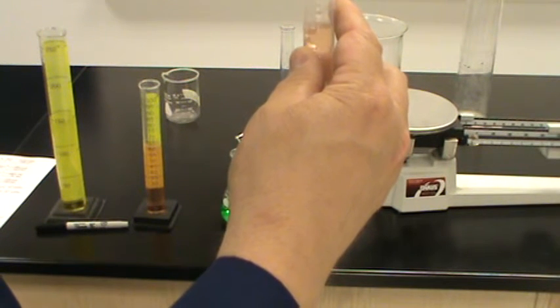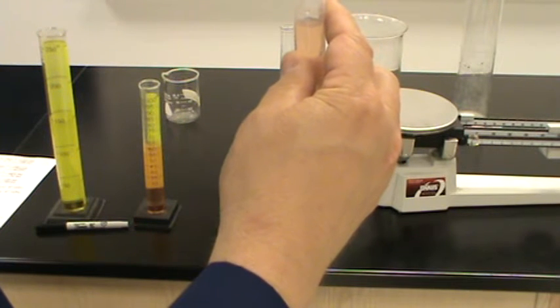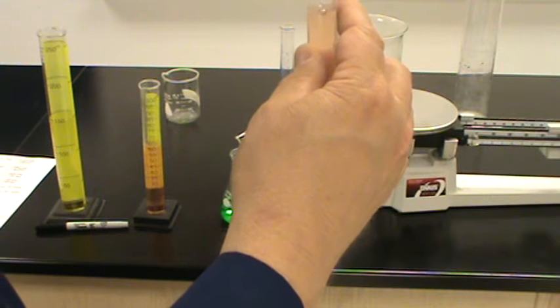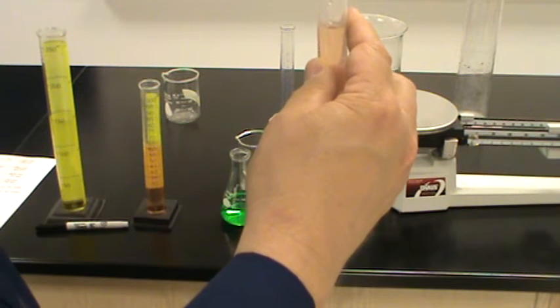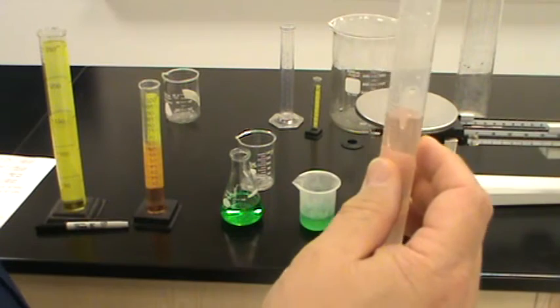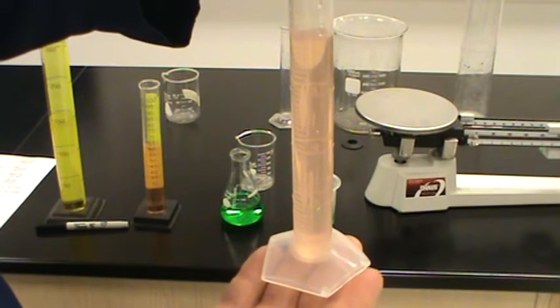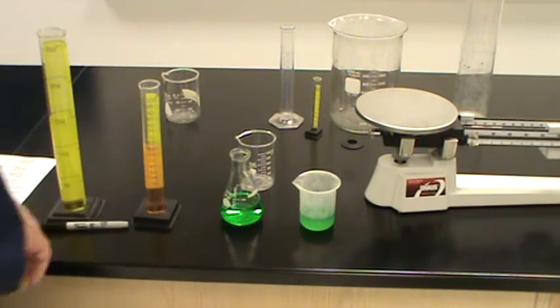And one of the things in science that hopefully everybody's getting used to is that nothing happens in a hurry in science. I think I can get one more drop in there. Let's see. Does he do it? Does he go over? Oh, 2 drops, and sure enough, I'm right there at 20 milliliters of liquid in my graduated cylinder. So I'm going to get rid of that.